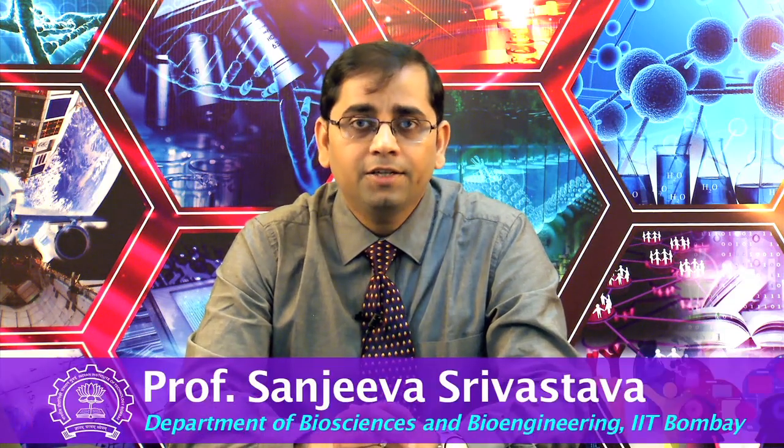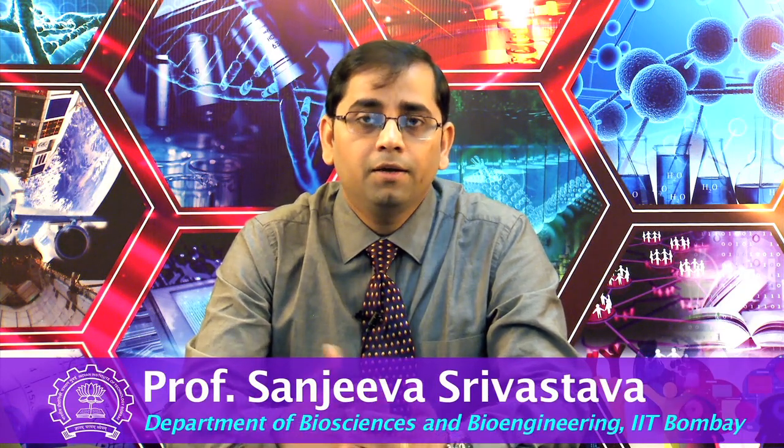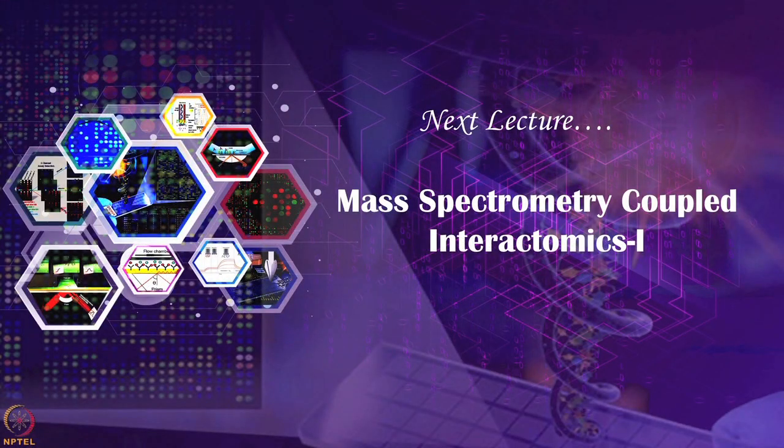Today we tried to provide you interaction with one of the leading companies and their application scientist, who talked to you about MST technologies and also the quality control assays done using Tycho technology. I hope these provide you some insight about how to do your experiments to further characterize proteins using the latest label-free biosensors. Thank you.